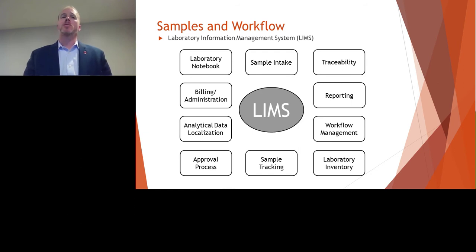Depending on the size of your lab, you may have different individuals that do different things. You may have a group of lab technicians that do extractions and sample preparations, as far as vials are concerned. And then you may have another group of chemists that actually work with the instrumentation and collect your data and reporting.